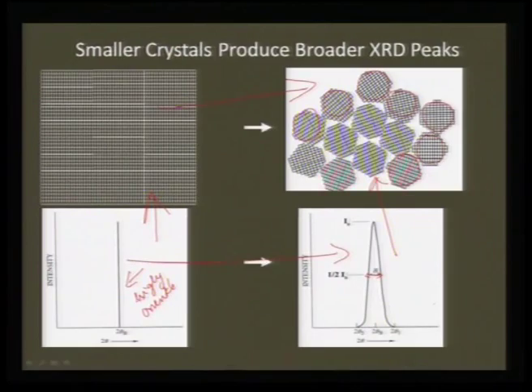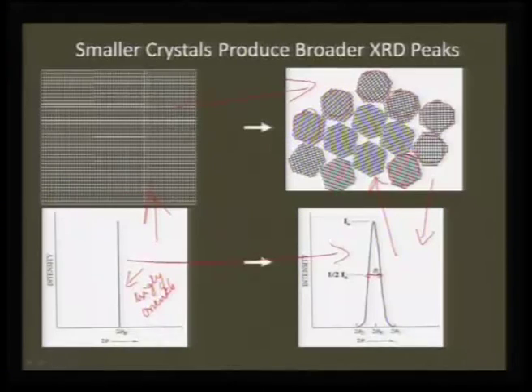So we are talking about going from a bulk to a very small dimension, and typically for that matter nano sized powders will either be amorphous in nature or will have a very broad peak like this. And when there is a broadening, you should understand broadening necessarily does not mean it has to be very low sized crystallites or nano size.